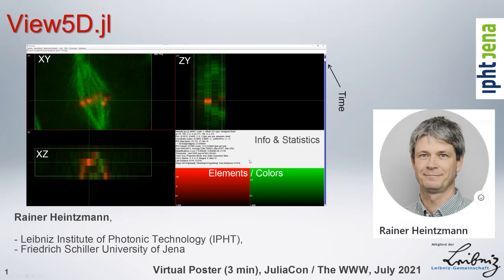As you can see, it can display up to five-dimensional data. You have here what is called elements of color, and here you have the time direction, and then you have these orthogonal collected views. When you're dragging this crosshair around, you will see all of these views updating.